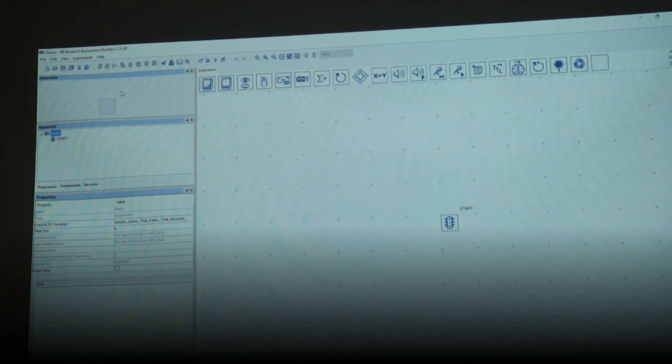There's no real utility of it, but whatever helps you visualize your experiment, it is just one of those tools. So as you build things, they will make up a map here in the overview. And if you want to ever go back or check what is where, that overview gives you a good picture. So you will see how it develops as we make a task right now.